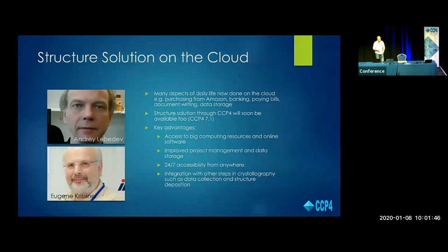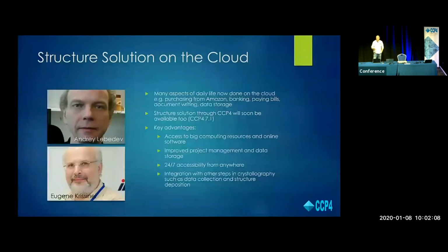The main advantages of it are that you can get access to big computing resources, and also use the software online rather than having to have it locally installed. You might have used CCP4 Online, which is very much about big programs that take a long time to run, such as Morda or MrBump or Ample.